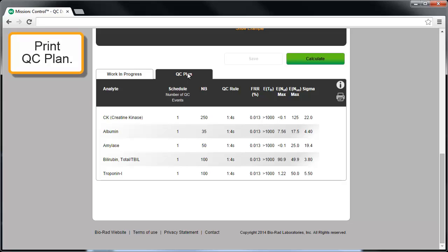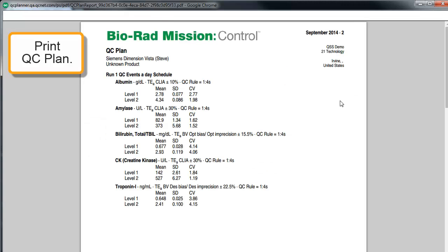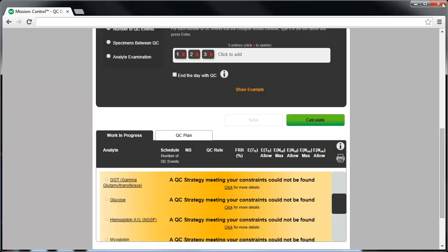When the QC Plan is complete, you can print it by clicking on the printer icon in the header of the QC Plan tab, and you'll see a summary of relevant information about each analyte in the QC Plan.